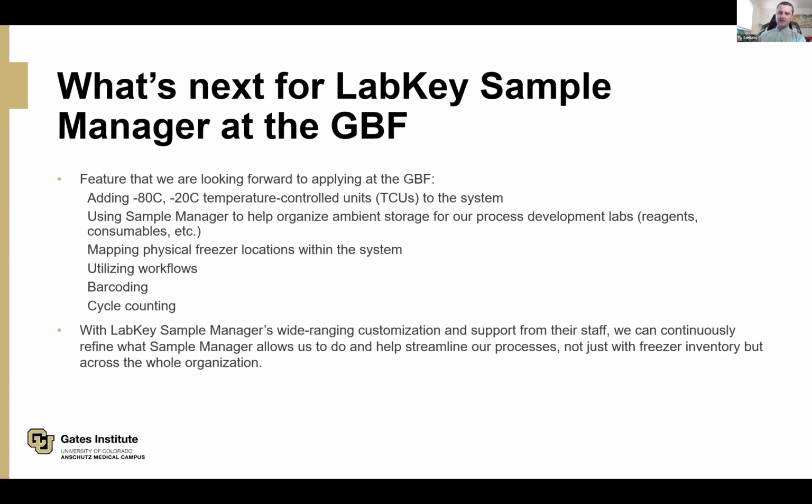We also have the option, and we haven't done this yet, but we're looking forward to doing this, of mapping the physical freezer locations in the system. This might not sound as important to someone who's been at the company for a long time, but if you have a new employee and you're training them to use this inventory software, it's really nice for them to be able to see what units or what freezers are in which rooms. So instead of just saying, this is in this one equipment, they can see which samples are in that equipment in what room, and be able to really efficiently go and find and move those samples as needed.